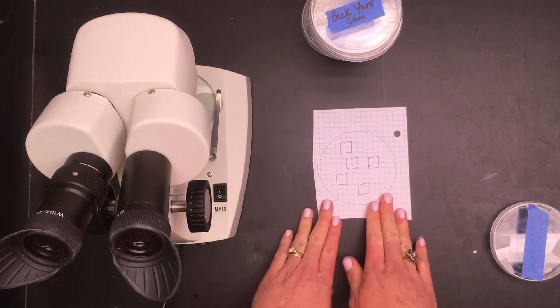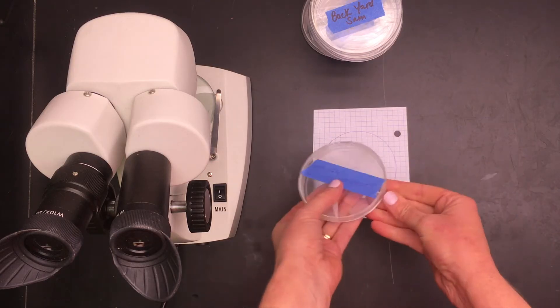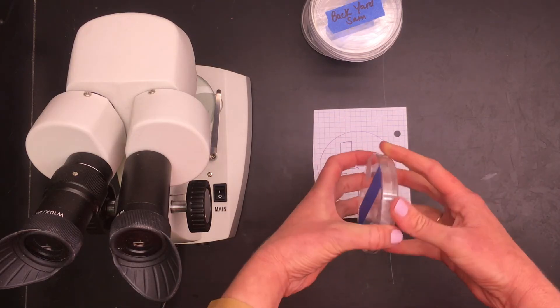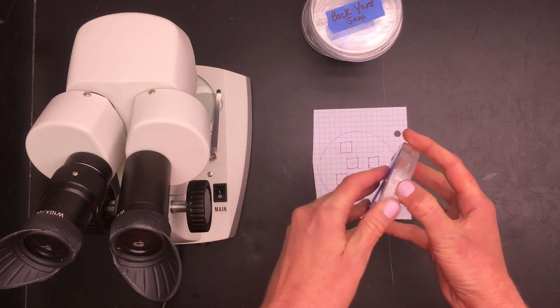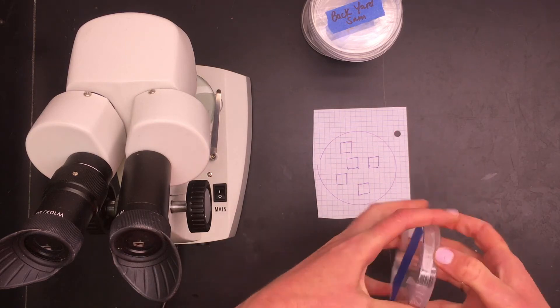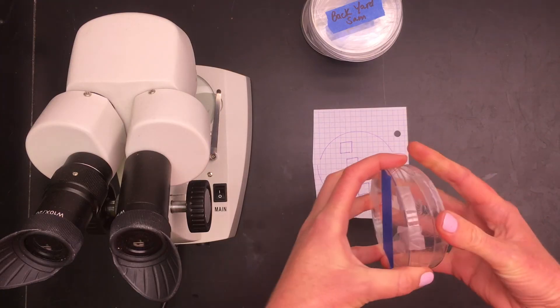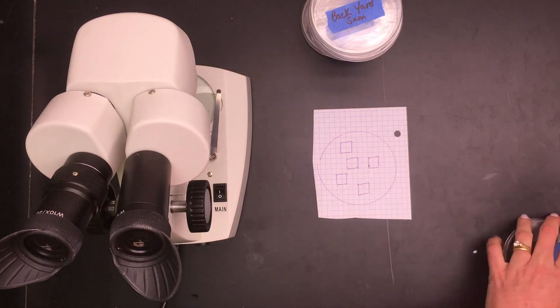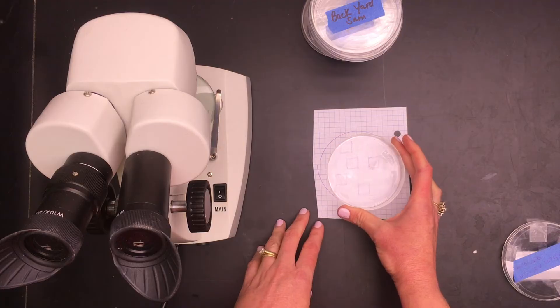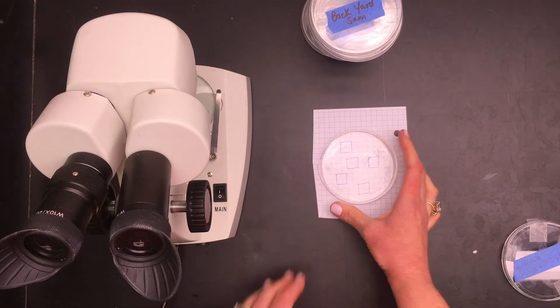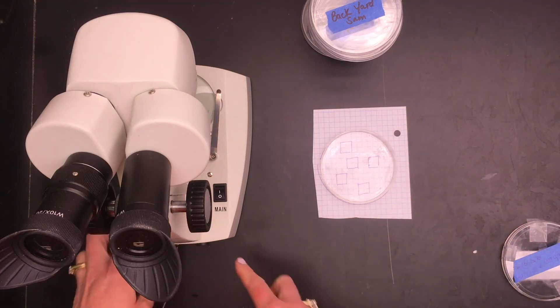So you only need one template. Then when you get back to lab, you're gonna unpeel the tape. You can use some scissors if you need to to get the tape off. And now you're going to count your particulates.